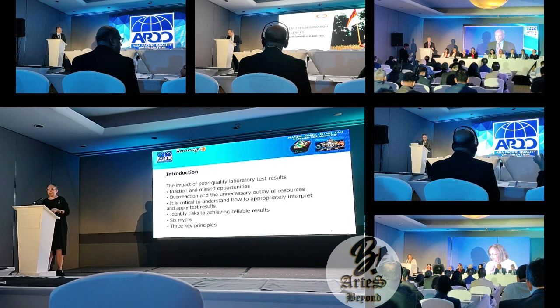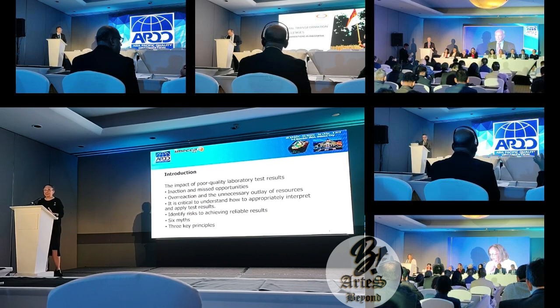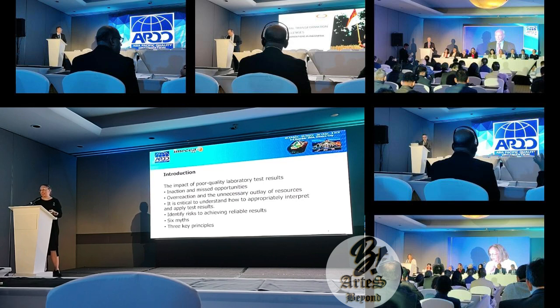In the reverse case, we may have some results that are showing that the water is terrible, it's failing to meet the standards, and yet if it actually is meeting the standards, we're likely to spend more money on infrastructure than we need to, put extra effort and time in and spend resources that didn't need to be spent. So how can we make sure that, number one, we are getting good quality results, and number two, that we're applying those results correctly in a way that makes the most of the fact that we have a result.